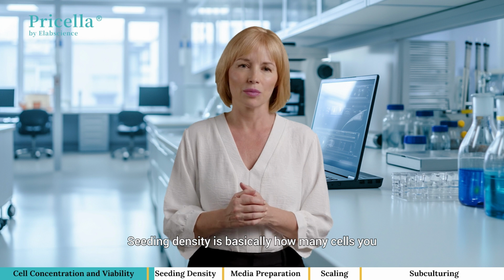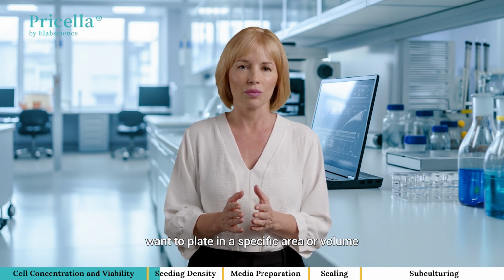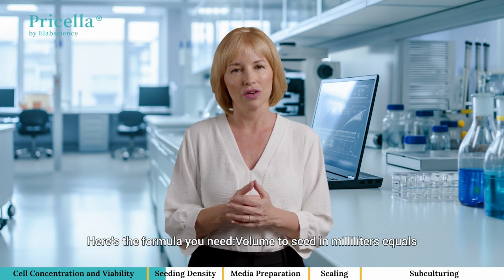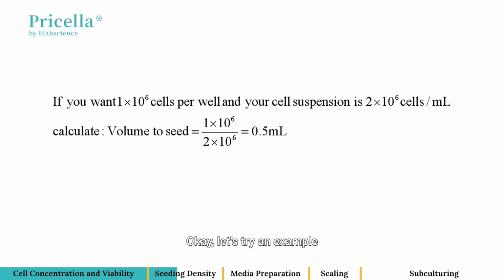Seeding density is basically how many cells you want to plate in a specific area or volume. Don't worry, it's easier than it sounds. Here's the formula you need. Volume to seed in milliliters equals the desired cell number divided by the cell concentration. Okay, let's try an example.